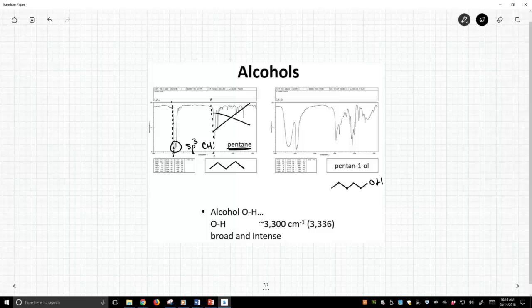When we go to pentanol, what we've added is this OH. And so what we still see is just to the right of 3,000, we still have lots of sp3 CH's, which we should see.